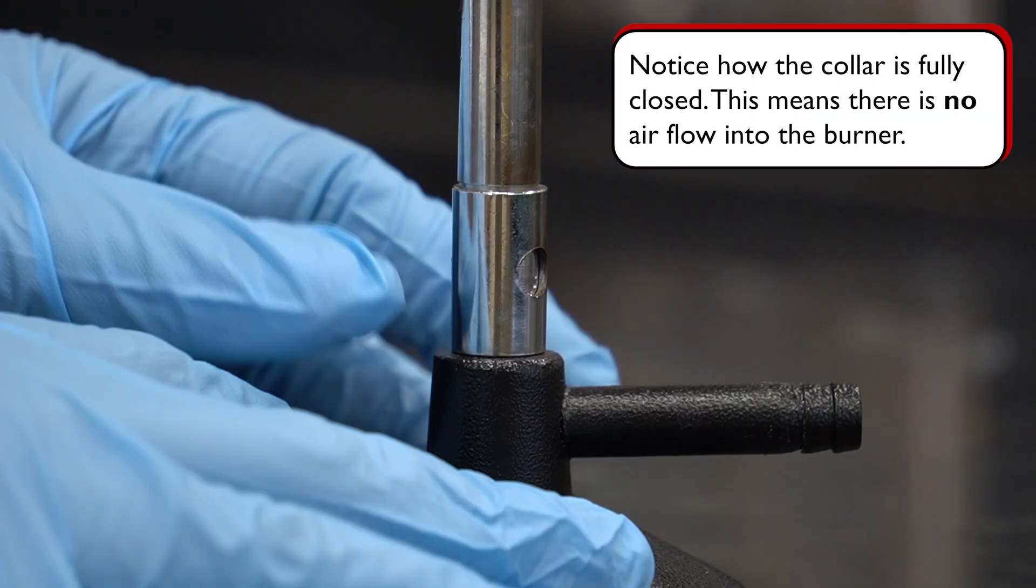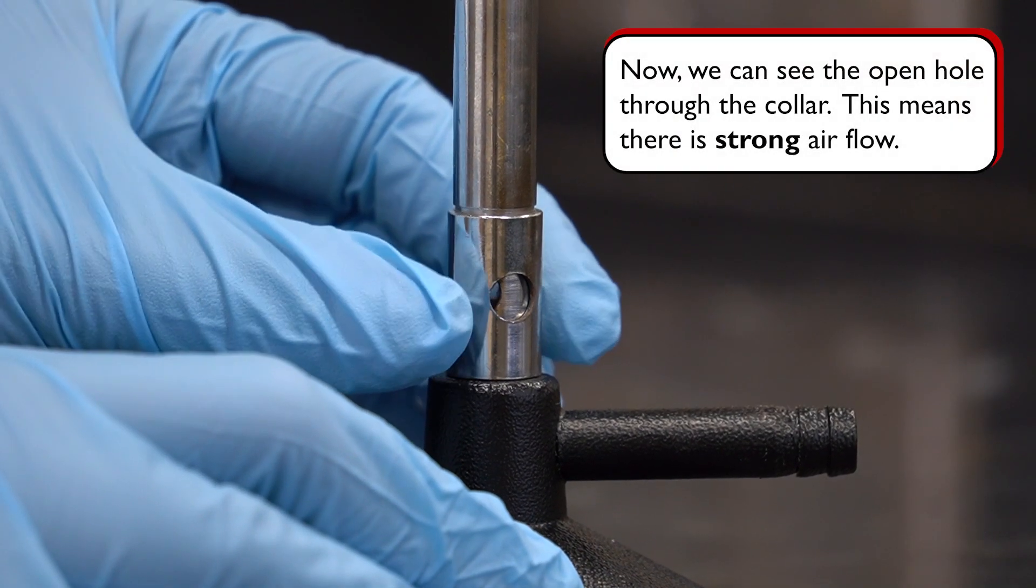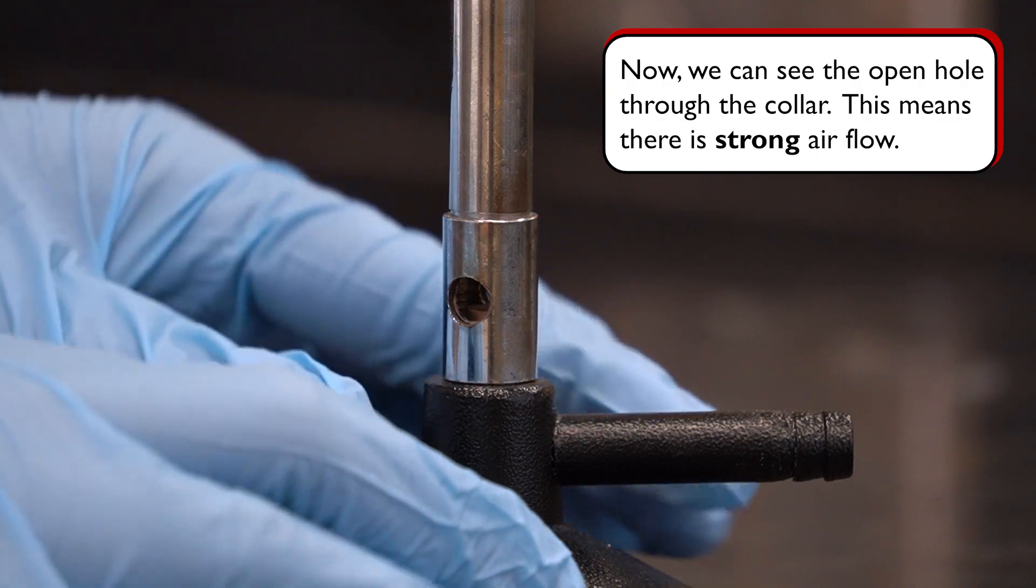The flow of the air can be adjusted by twisting the collar, which will adjust the temperature of the flame accordingly.